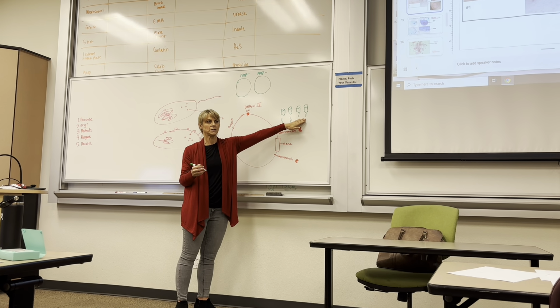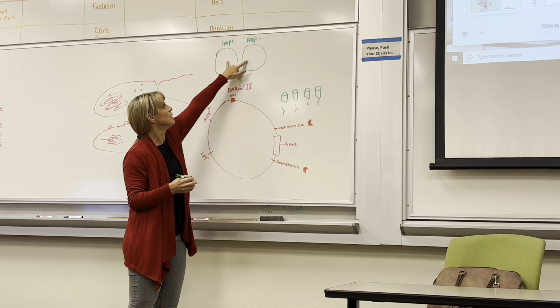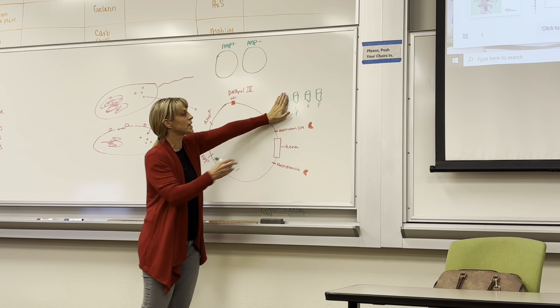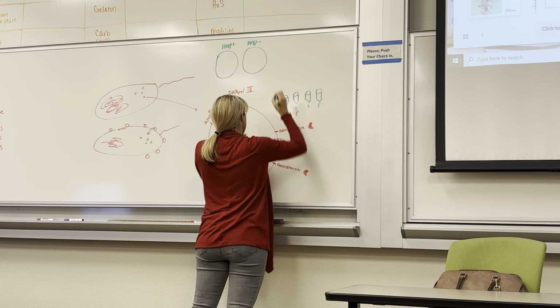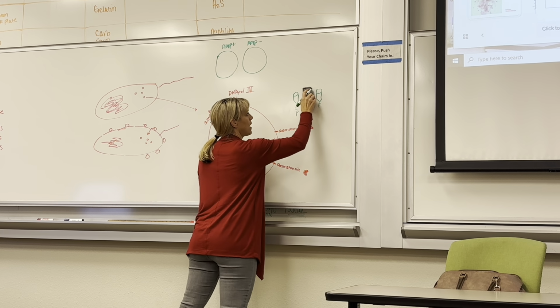The size difference? One was a small plate, one was a big plate. Well, that's because one had antibiotics and one didn't. Are you sure we didn't just have 2 like that? The controls were ampicillin negative, plasmid negative, to make sure they had growth. And then the other control was ampicillin positive and plasmid negative, to make sure that we had no growth. So I think here we only had 2 like that.